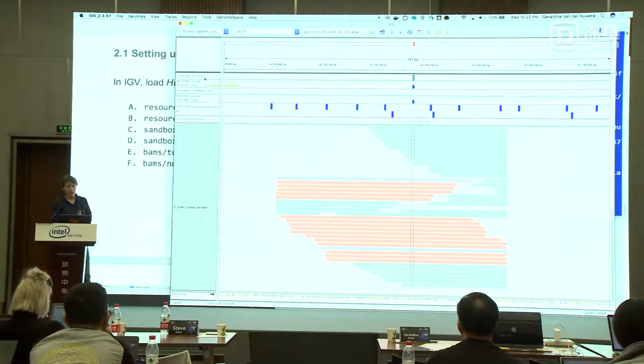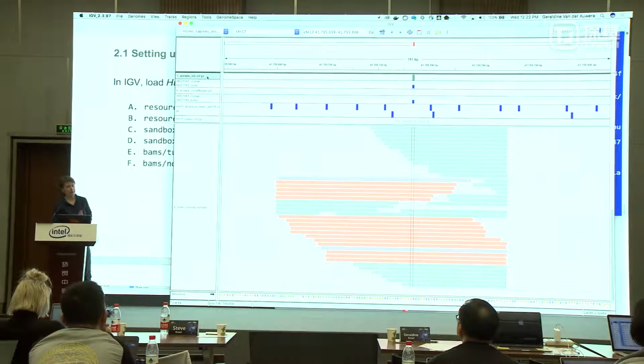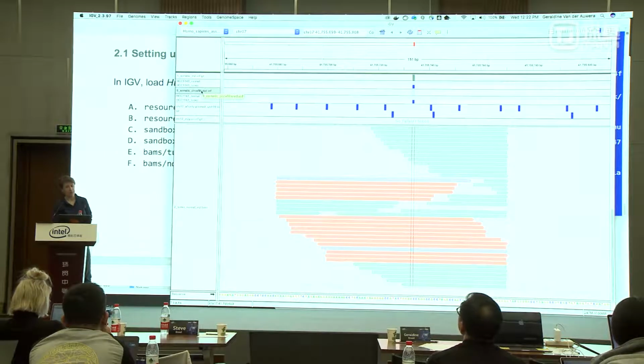So now we have several variant tracks. At the very top, we have the raw calls. The next one also includes each of the samples, right? On the next one, you have the filtered calls.